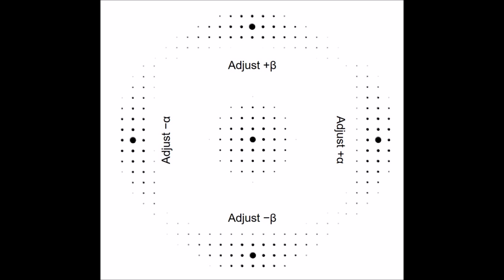And so this is what I have termed a tilt map or a tilt cheat sheet. There isn't actually an official term for this. This is just something that I've made up. I've actually never seen anybody derive one of these. This is actually the first time, so maybe I'm taking credit for that.